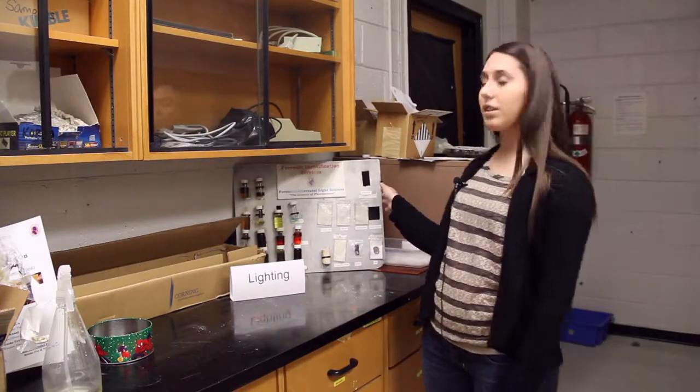Then we utilize alternate light sources, which we'd like to demonstrate on our little sample board here. We have a variety of samples such as different cleaners and motor oils, as well as different packets with semen, hair fiber, and blood, just to show how they fluoresce when exposed to a UV light source.